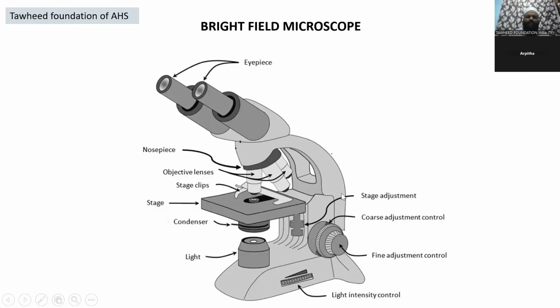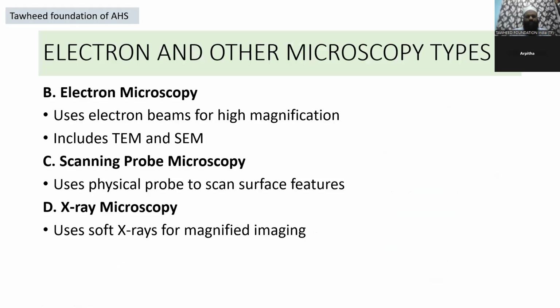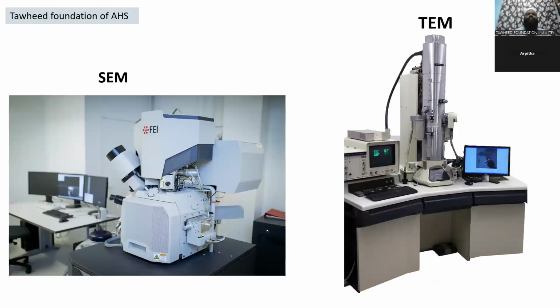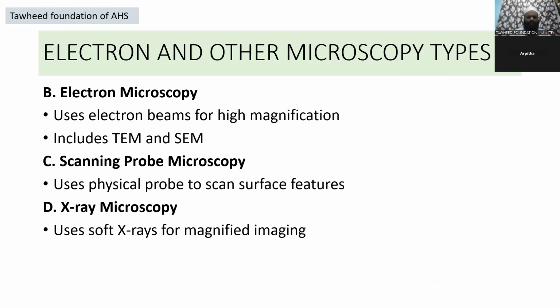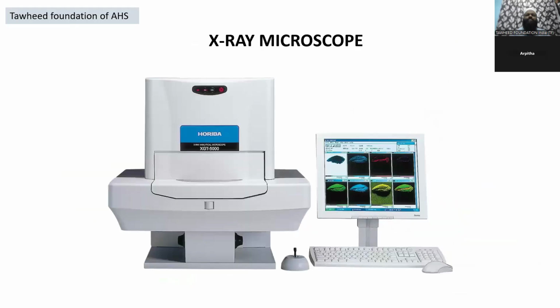Electron microscope can also be asked for a 5 marks question, where you have to explain what is an electron microscope, scanning and transmission electron microscope based on the working principle, and also the advantages, disadvantages, and uses of scanning electron microscope can be explained.